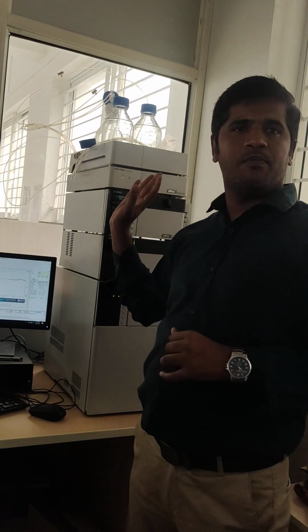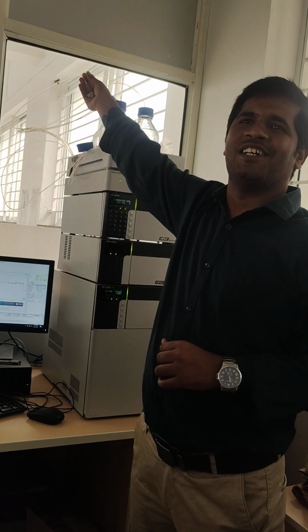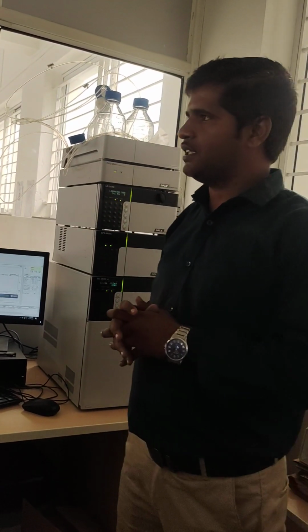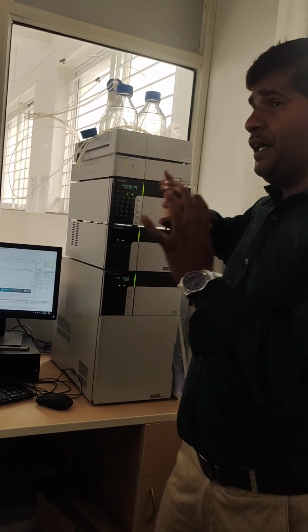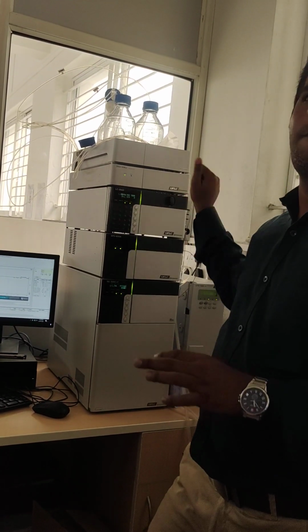Now, I have already purged 2 ports because I wanted to use only 2 ports. I will not use this C and D and the other rinsing port. That's why I have already purged. Yesterday I analyzed quercetin and rutin, so I will not purge it again. Now, if purging is completed after 30 minutes, we just close the valve.